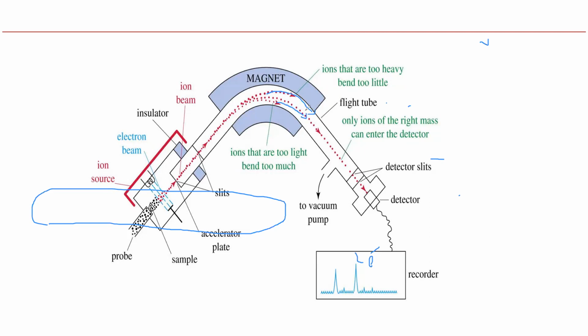Here, the magnetic strength is represented with H. It is directly proportional to, so here what happened, the molecular ions and the fragments are following the radius path, which is nothing but the centrifugal force of your molecule.